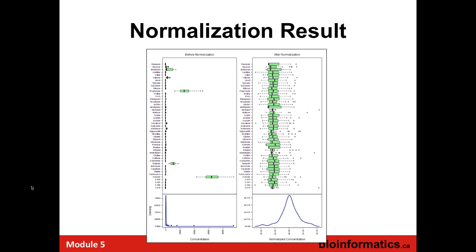I think if you're dealing with urine or some other sample, you might want to try normalizing to some external sample. So this is something you have to design in your experimental design, and you'd have either creatinine or something like that. If you're working with cell samples, you should normalize to the weight, the dry or wet weight of the samples. If it's fecal or stool samples, again, the tendency now is people normalize to a wet weight of material. Fruits and vegetables, people will work with wet weight. And so that's one way of normalizing or scaling.